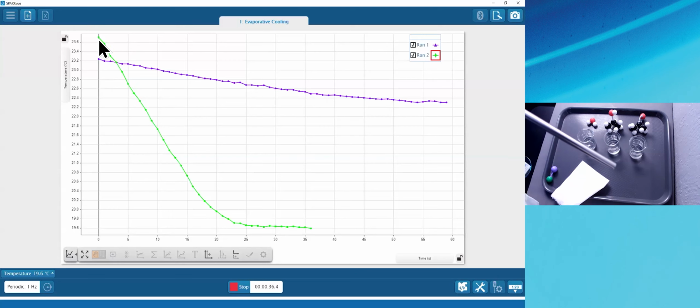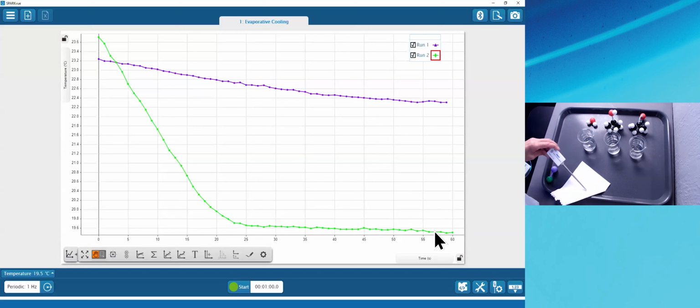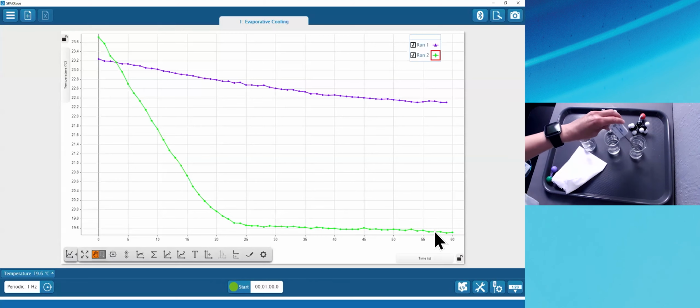I can see, even though it started warmer, and that was my fault for not bringing the solution out of the closet in time into this cooler room, and this can also sometimes happen based on pressure and humidity, but I see that it decreased and got colder. Even though it started warmer, it got colder. And we're waiting for a minute. Students are looking at that drop and saying, wait, it's really small now on the end of that sensor. Okay, so then they dry the sensor and they are going to do the run with acetone.